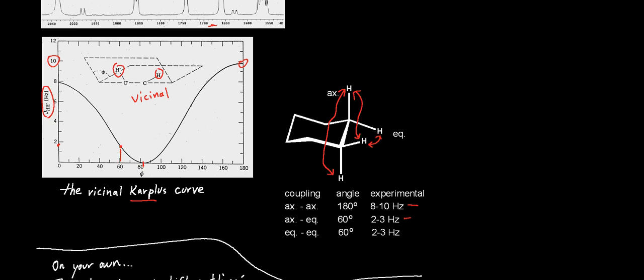So the little differences in observed and experimental were actually refined by his later work, but this is still a pretty great approximation and can be cited in publications still to this day. So you're getting not only where the protons are connectivity-wise because they couple to each other, but also geometry information.